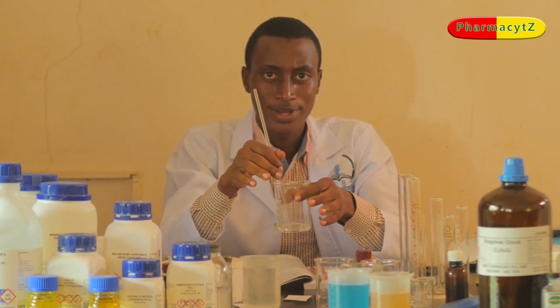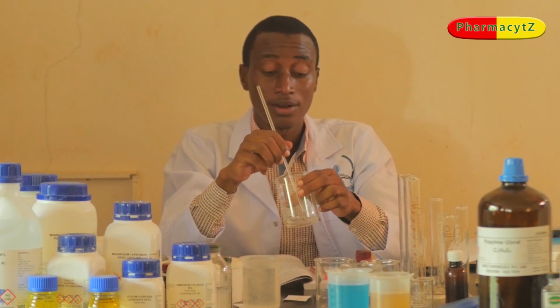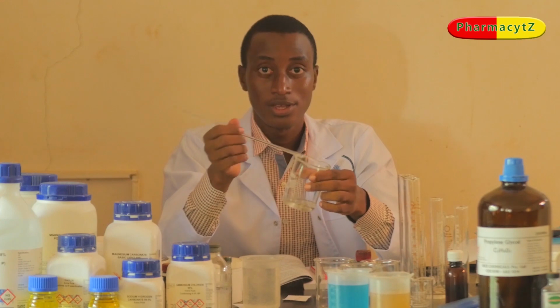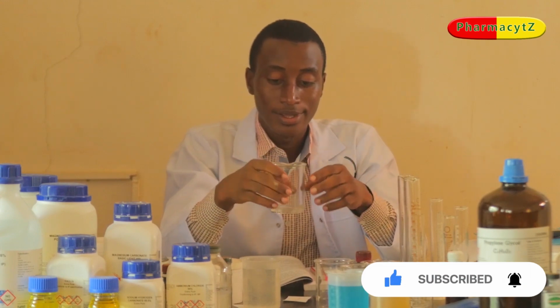So as you can see, nothing is taking place. Iodine does not dissolve in water, or sometimes you can say it poorly dissolves in water. So in this case, there's no solution you can make. What you can do is first make a solution of potassium iodide, then dissolve iodine in that solution.